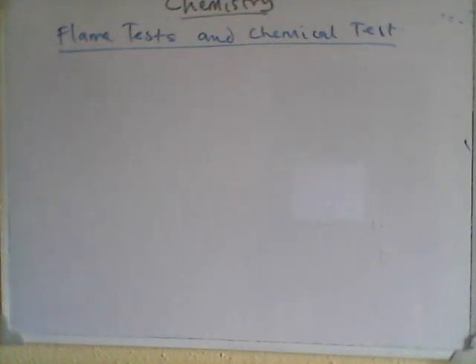So today we will be looking at flame tests and chemical tests, still under laboratory techniques and safety. In this video we will look at an introduction to flame tests, what flame tests are, and chemical tests for cations and for metals. Then we will see tests for negative ions, and the gas tests.